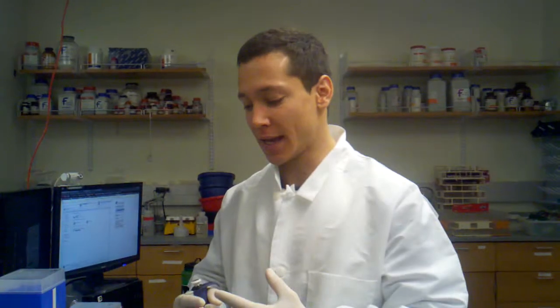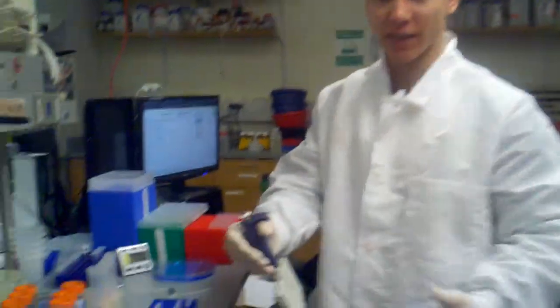So we're going to be starting a protein gel, and this is 3 steps. Step 1 is going to be preparing our samples, and step 2 is going to be preparing our gel box. Step 3 is going to be loading and running our gel.